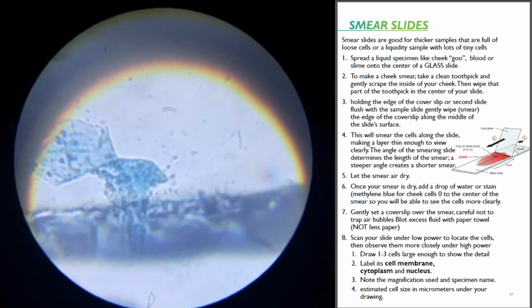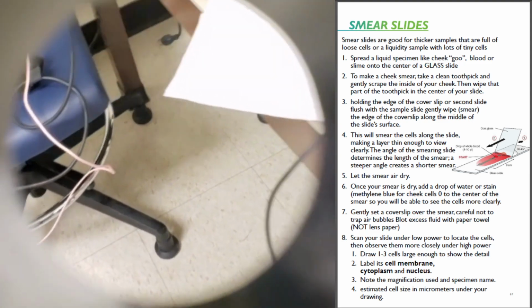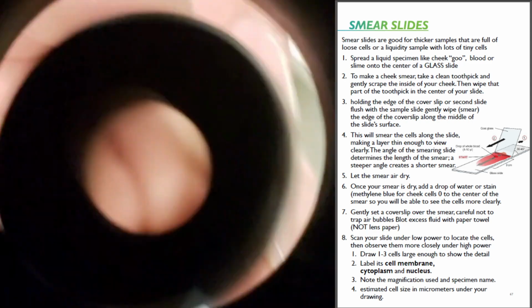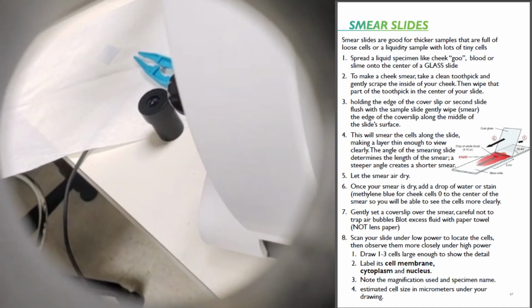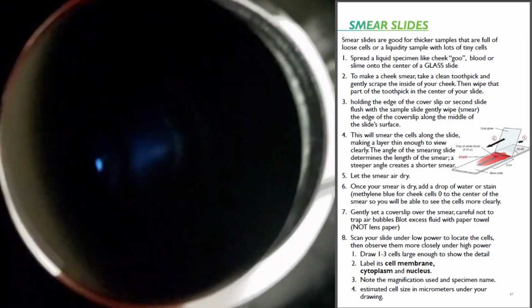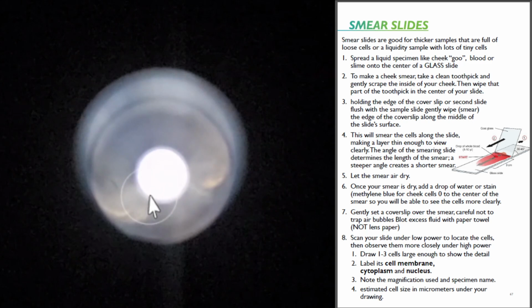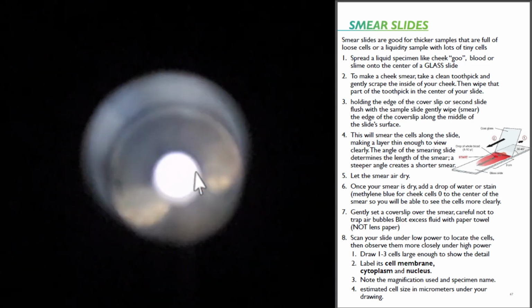Okay, let me try this again. All right, I'm going to switch to the 20. Yep, so here's my 20x. I wish it were just a little bit longer to give my camera a little more stability. Yeah, not happening.